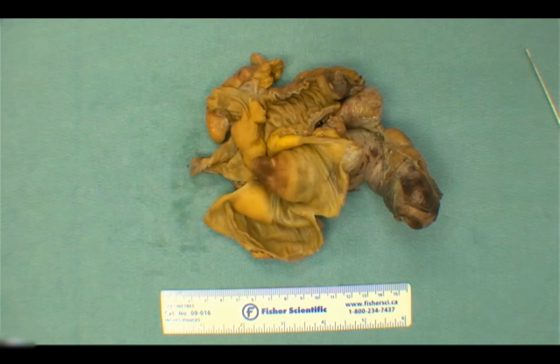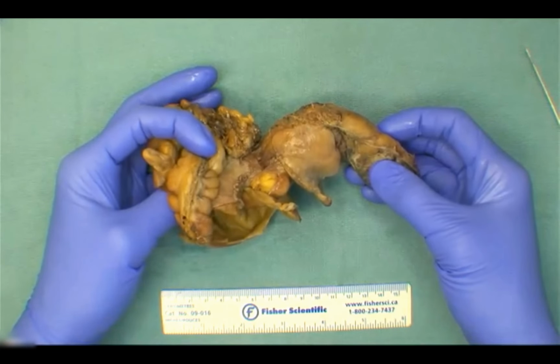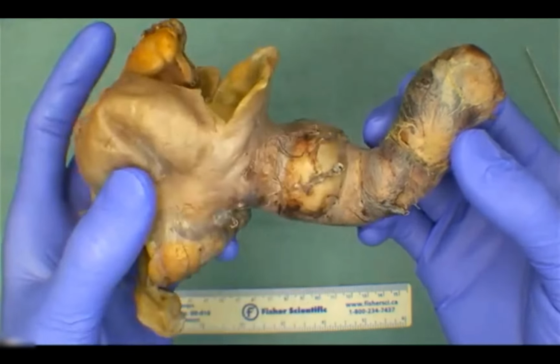So this is where we are. We've got an ileocecal resection. We've got some pretty interesting pathology with our appendix. Let's go into the chat now and get some descriptors for what we're seeing. I'm just bringing this up to the screen a little bit closer. Go ahead in the chat. How would you describe this?